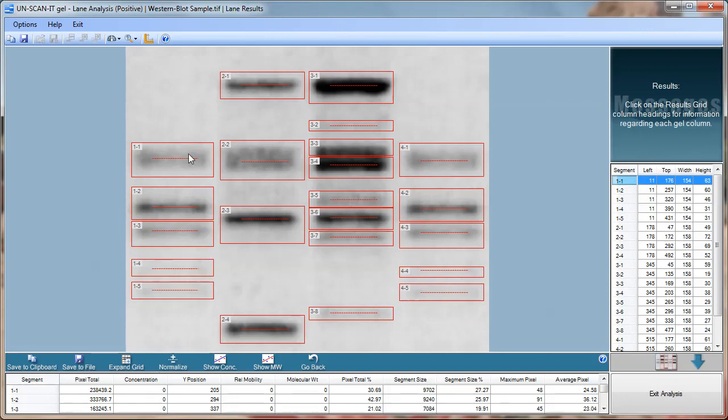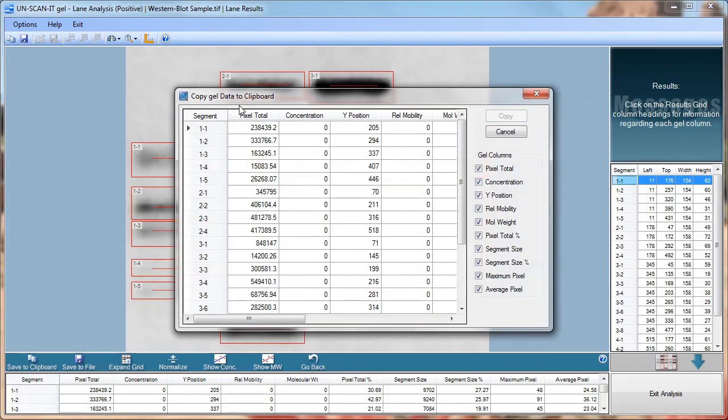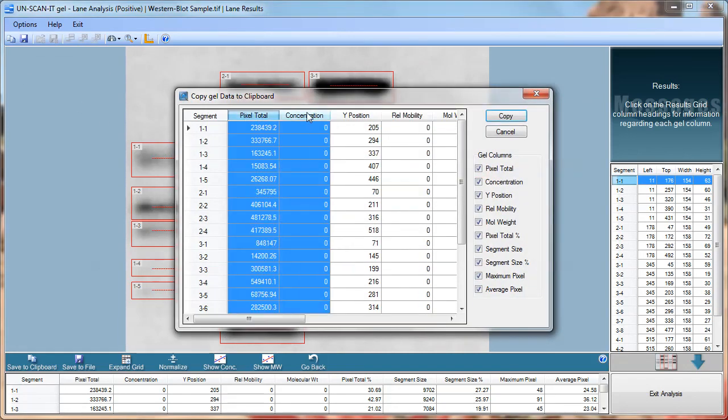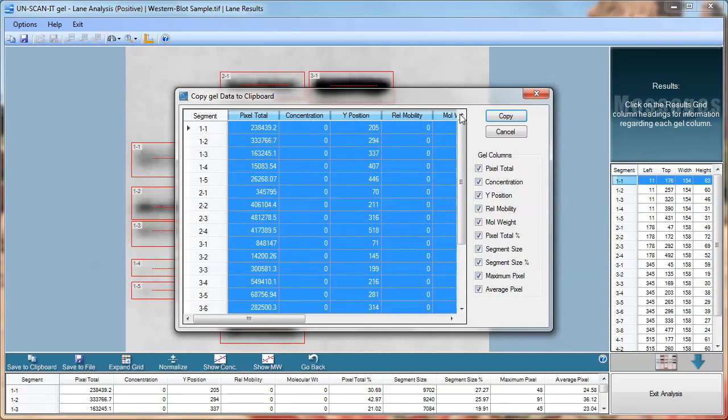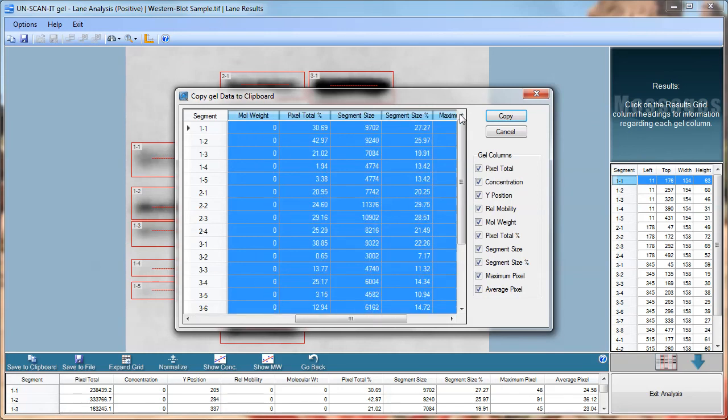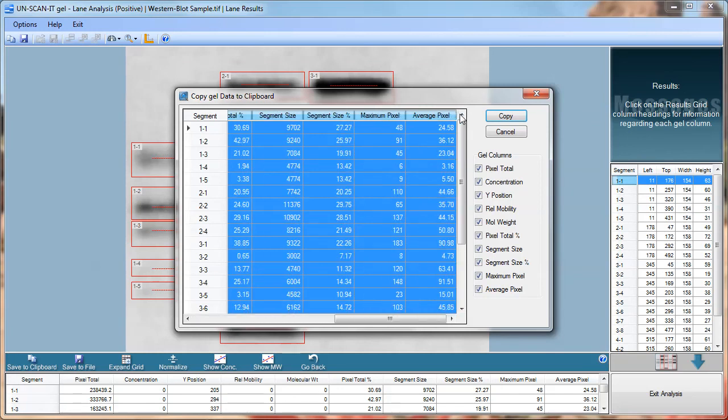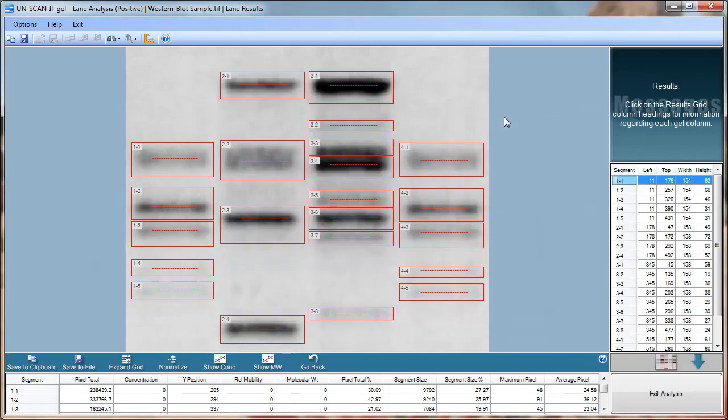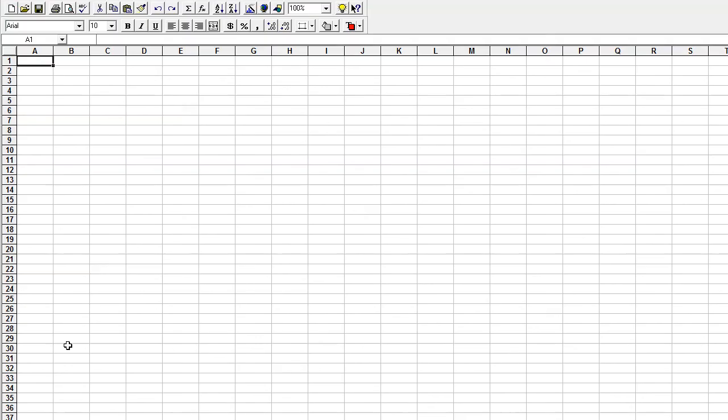The analyzed data can then be saved to a data file or copied to the clipboard. The data can then be pasted into Excel or any other spreadsheet or data analysis program.